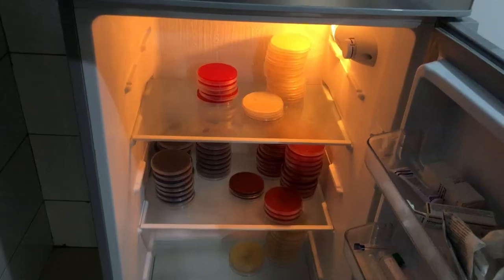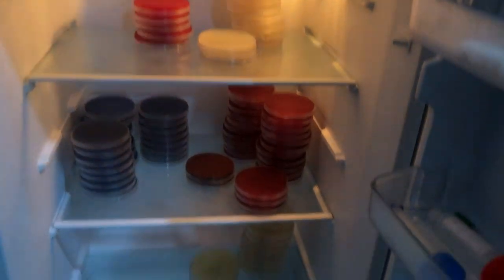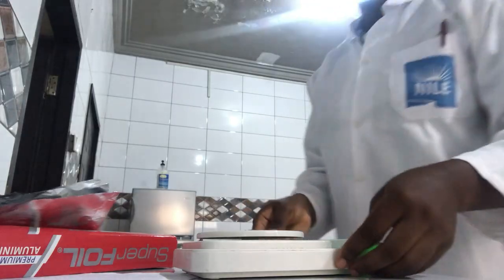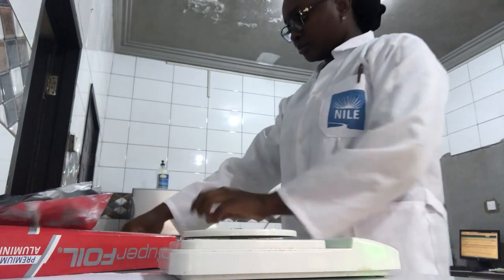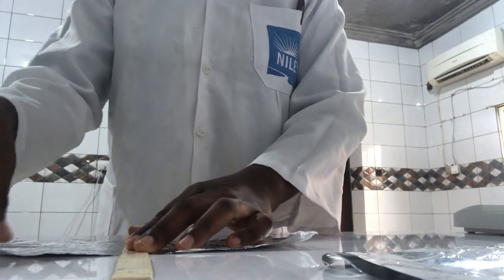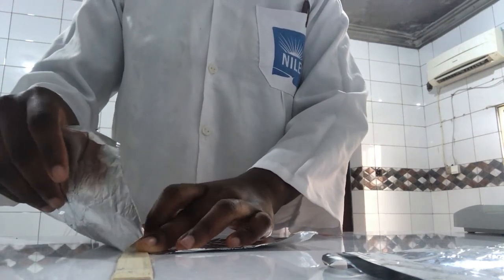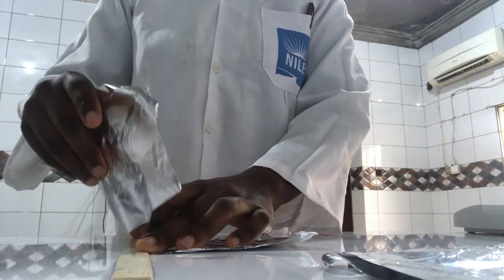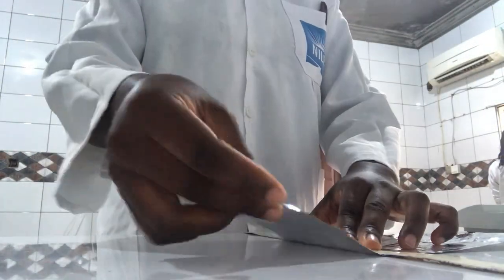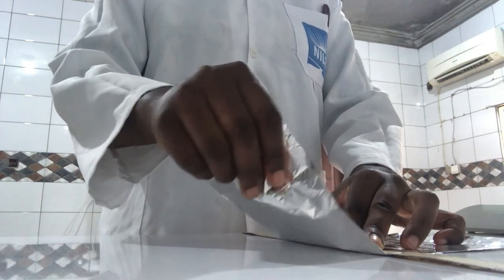On this day I woke up around 6am and when I got to work it was a rainy day. Usually at work I disinfect the desks before I start anything, but on this day it had already been done, so I just checked what media we needed. As you can see here, I am getting the aluminum foil papers ready. We use these to measure the agar powder and also use the excess to seal the conical flask before we put them in the autoclave.